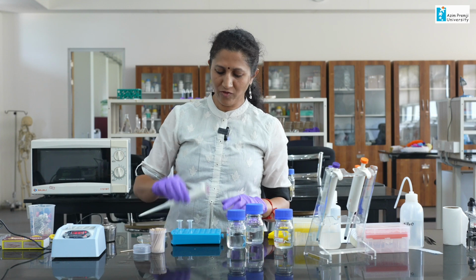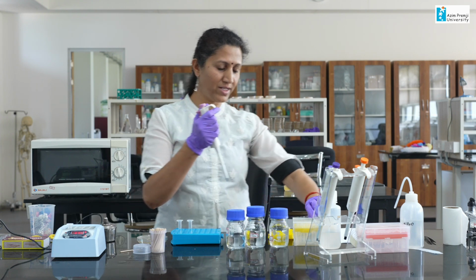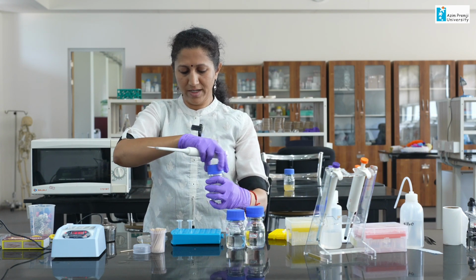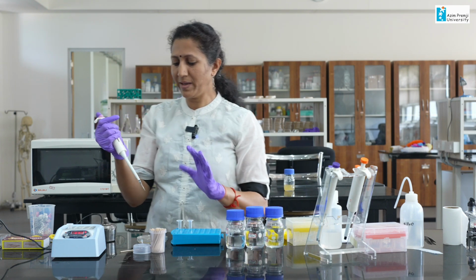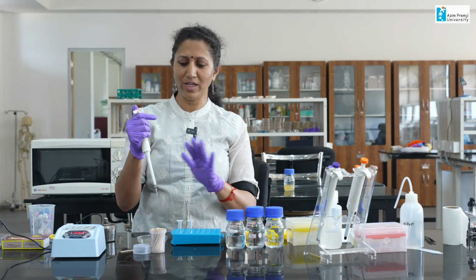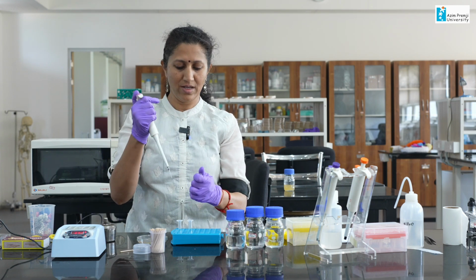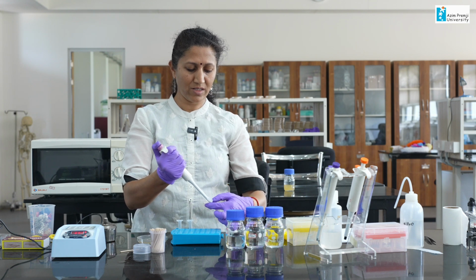It is going to be 4 minutes now. I have to add the next reagent immediately after the 5 minutes is done. So, I am keeping my next reagent ready, that is 3 microliters of Tris-HCl. You have to be careful that you can't start pipetting once the 5 minutes is done. You have to keep your reagents ready in the 4th minute, and immediately after the 5th minute, take the tube out, add this reagent and mix thoroughly.